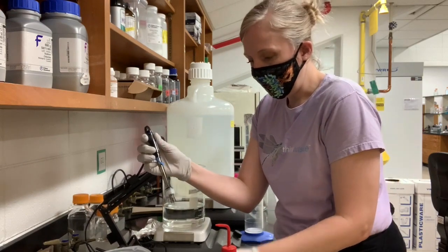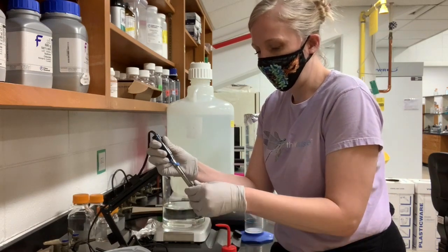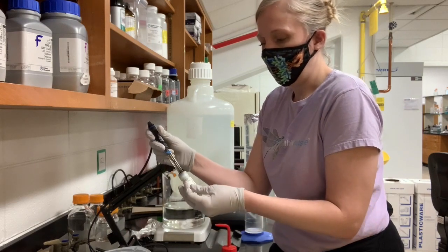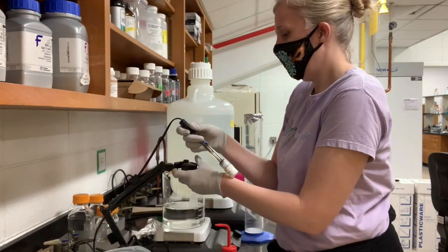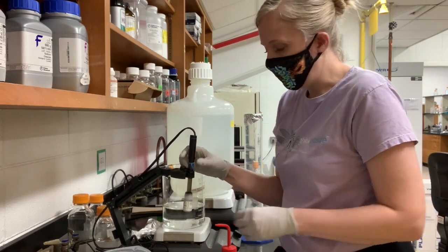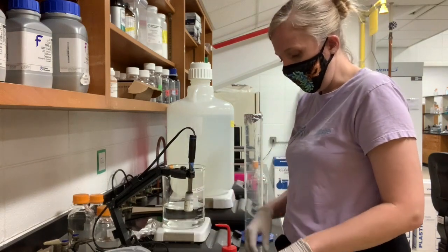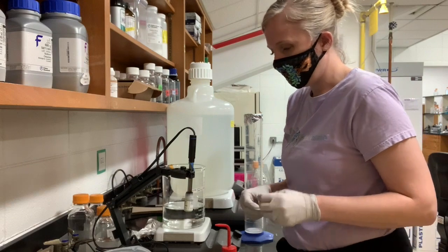So you want to line this up so that once this is back in the bottle, the probe is under the level of the solution but doesn't go all the way to the bottom. And then I'm going to twist this bottle to put it back on. So when you leave this machine, you should leave the probe plugged, so that hole should be plugged, and it should be in the storage solution. Leaving the probe to dry out can cause damage long term.